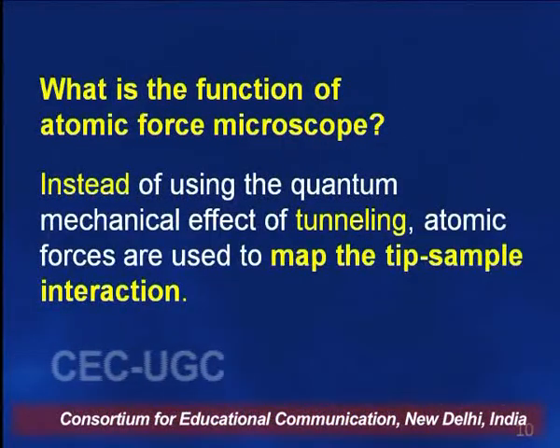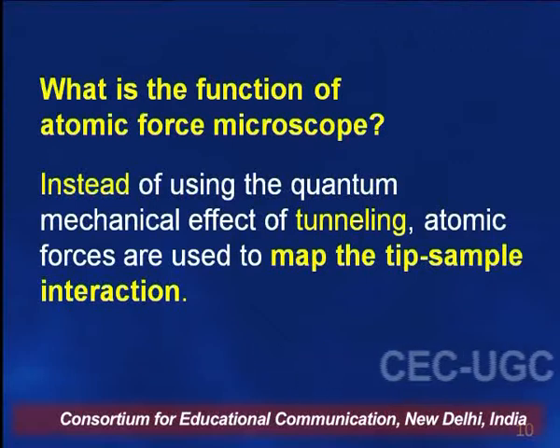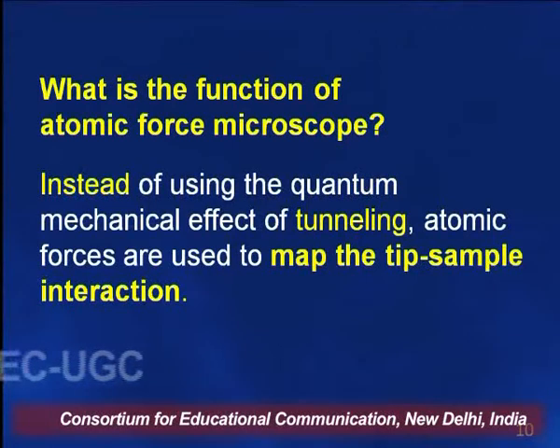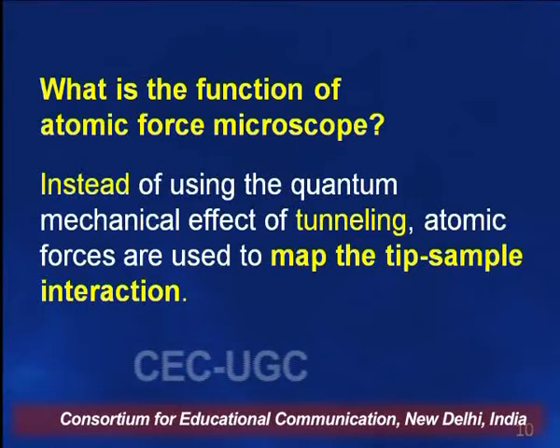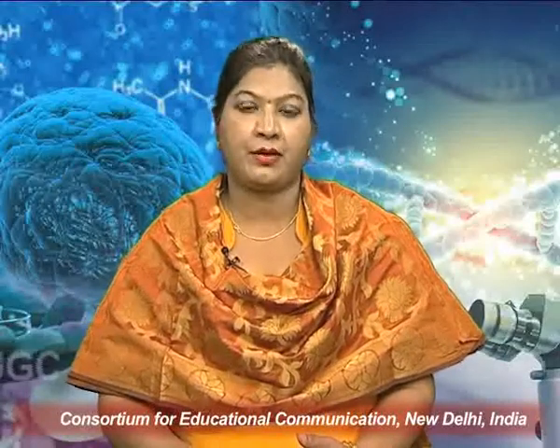As we discussed in the previous lectures, in the scanning tunneling microscope we used the quantum mechanical effect of tunneling. But here in atomic force microscopy, we use the atomic force to map the tip and sample interaction.